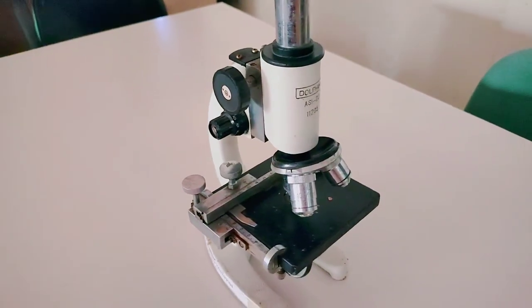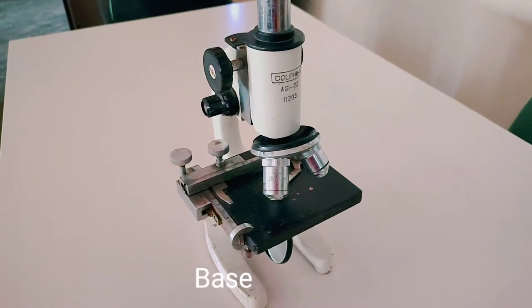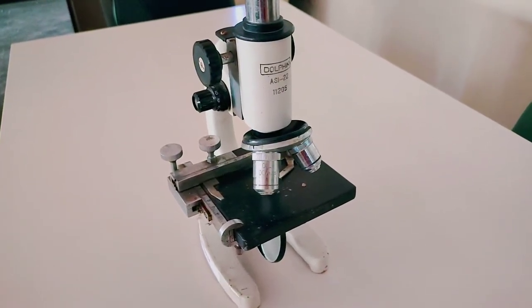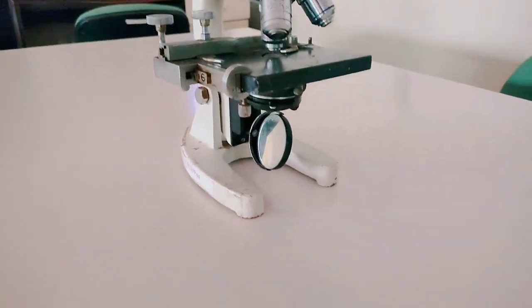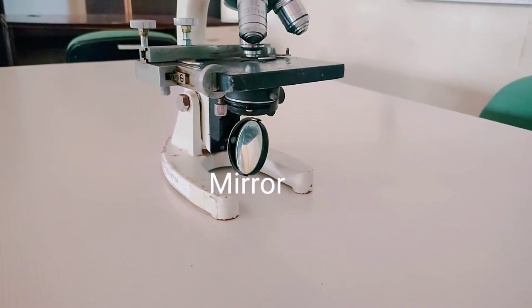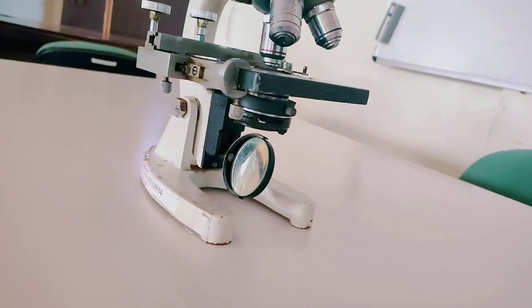Then at the bottom, this is called the base. After the base, the next part is the mirror. This one is the mirror, and above the mirror there is a condenser present.